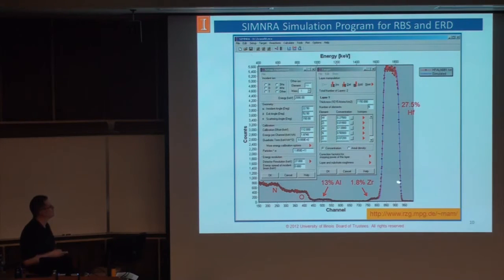So that allows you to calibrate your x-axis so that you can get that information. And then, of course, the layer thickness and concentration are stuff you put in, but then you can solve for. And so you can actually do the fitting of your curve that way.